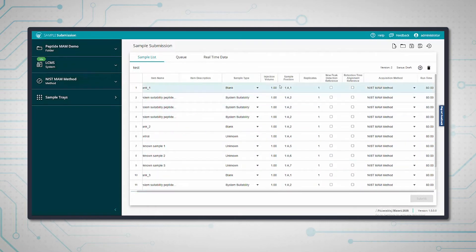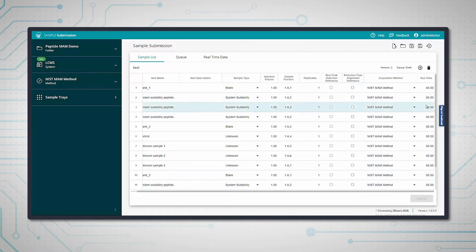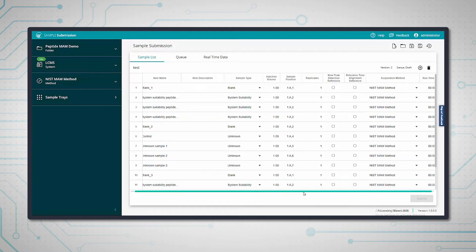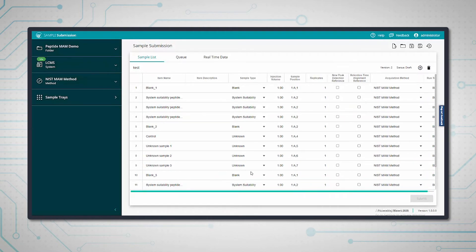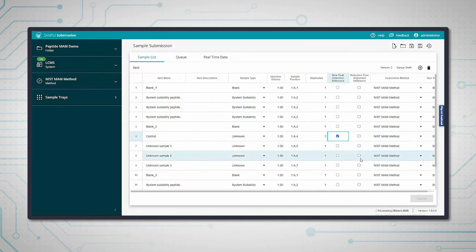We have to specify the sample type - blank, SST, unknown samples - as well as injection volume, sample position, replicates, the acquisition method, and the runtime. We also need to tell the software what to use as the peak detection reference, which will be the control sample, and the retention time alignment reference. For that, we normally pick something in the middle of the run, so I'll pick sample two.